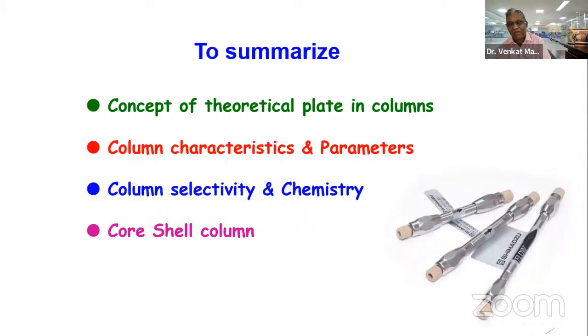Therefore, to quickly summarize, I have given a small glimpse of the concept of theoretical plate. I have introduced some of the characteristics and parameters of the column.